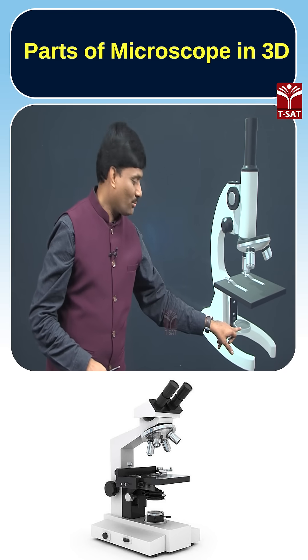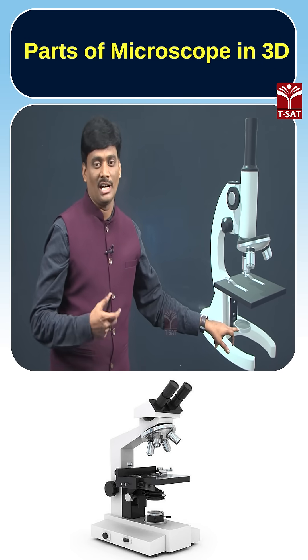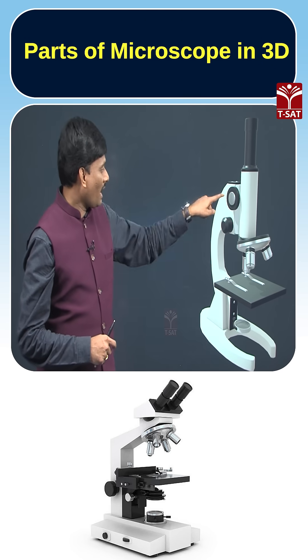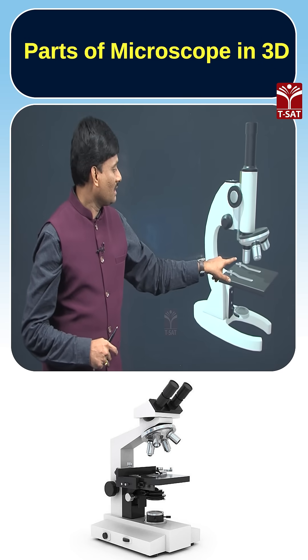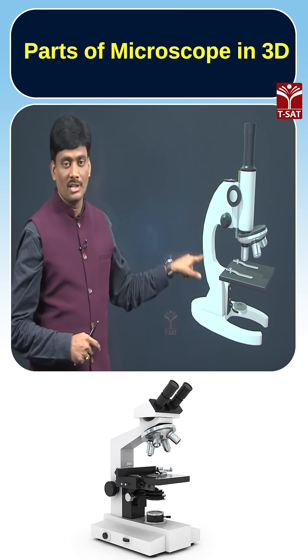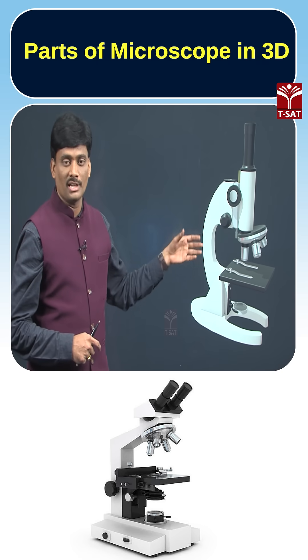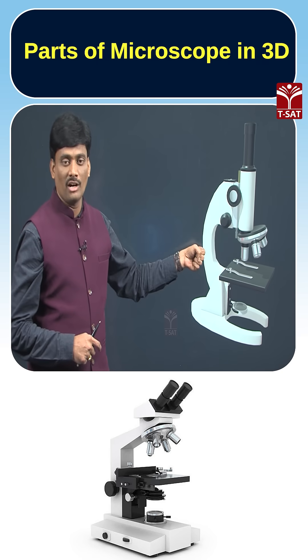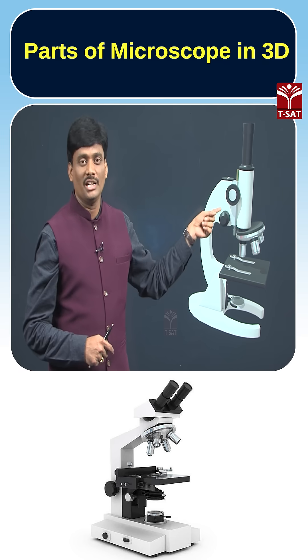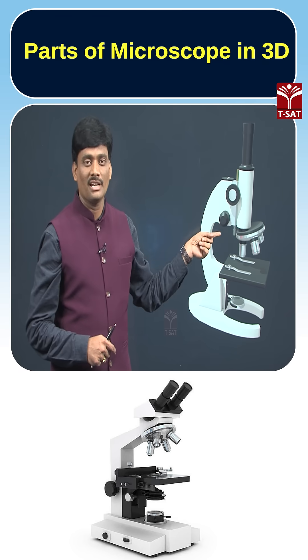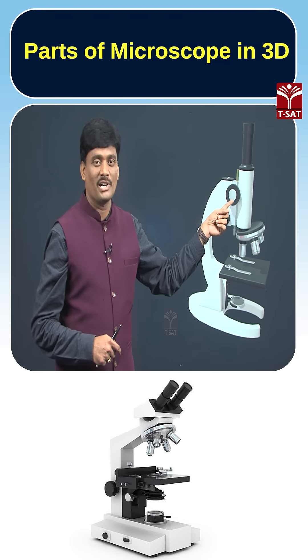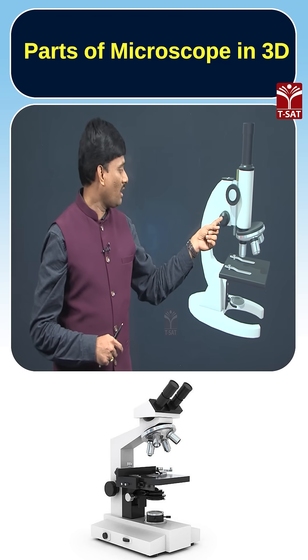After that, you are able to observe the mirror for the reflection of light. Next, this is called the arm — this is very helpful for holding the microscope. Here you are able to see two knobs: the upper one is called the coarse adjustment knob.